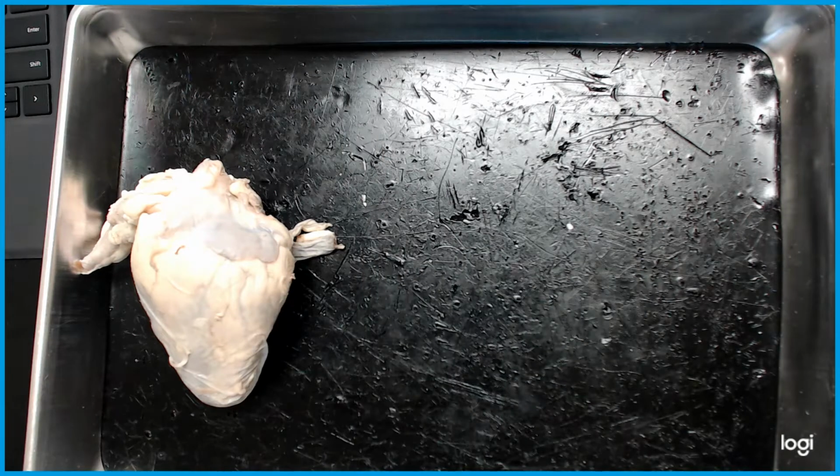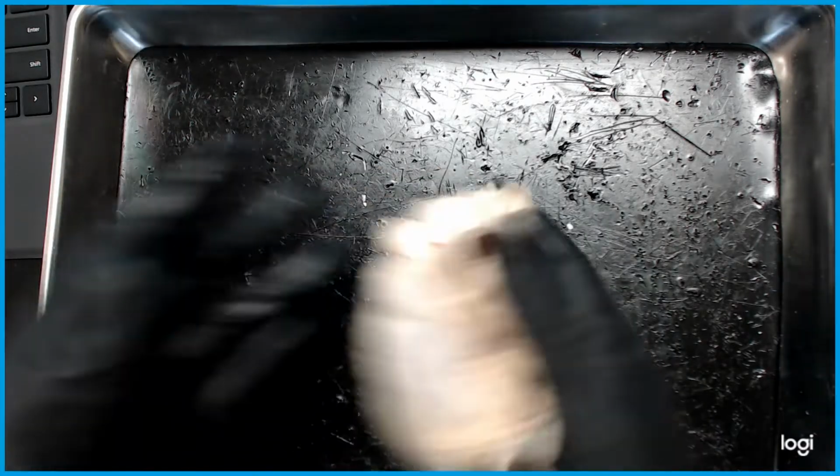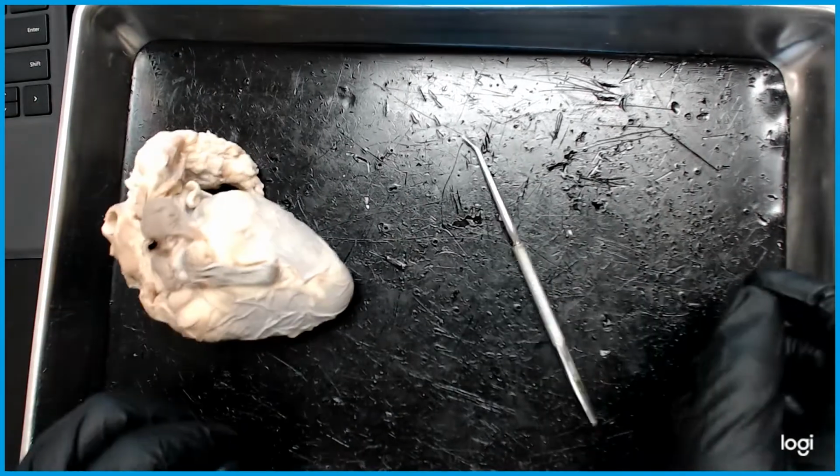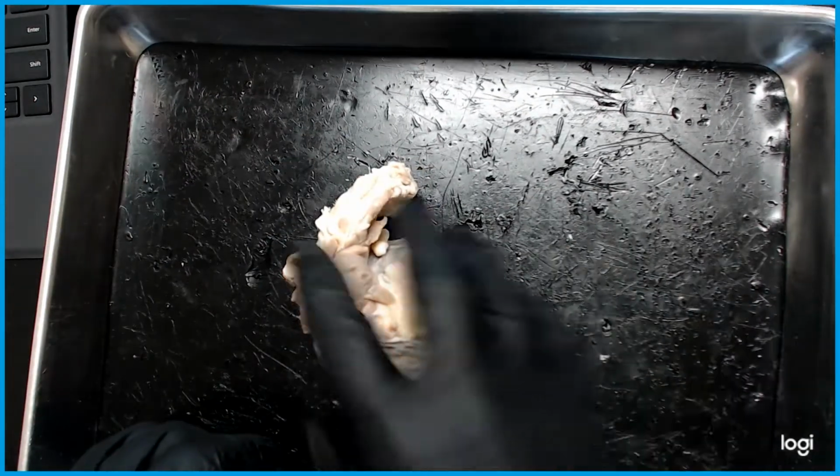You don't want to have your instruments in the dissection tray, because when you're doing this and you're moving everything around, your instruments are going to be in the way. If you have something that's sharp, you can always poke yourself, so you want to stay away from that.